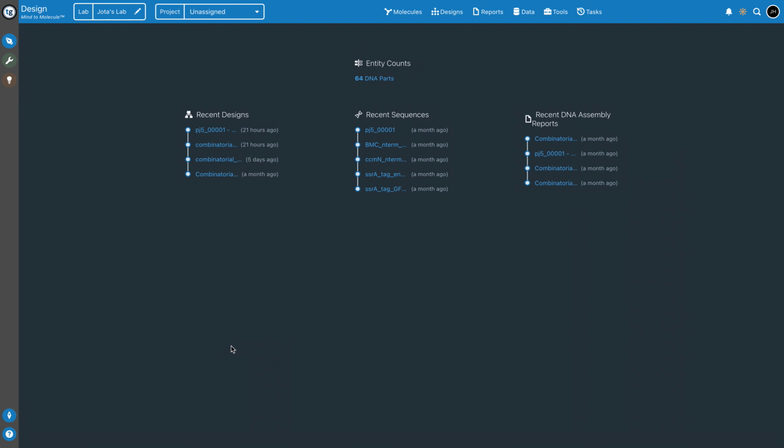What this tool basically does is partition that longer DNA sequence into smaller pieces so that afterwards you can assemble it in the lab, also taking into account any DNA sequence that you already have that can be helpful for building that target DNA sequence.